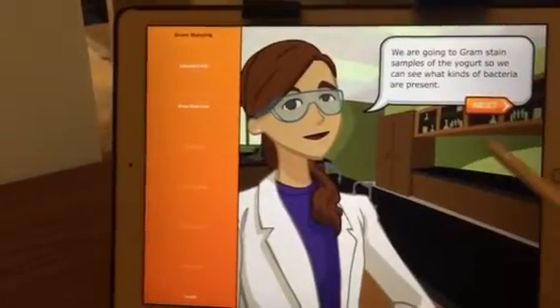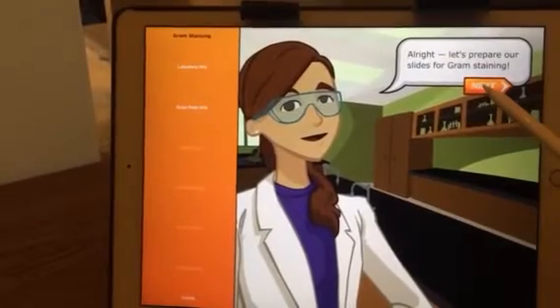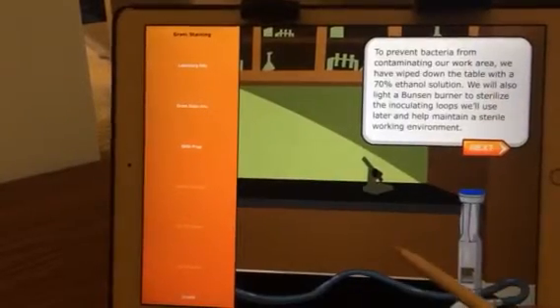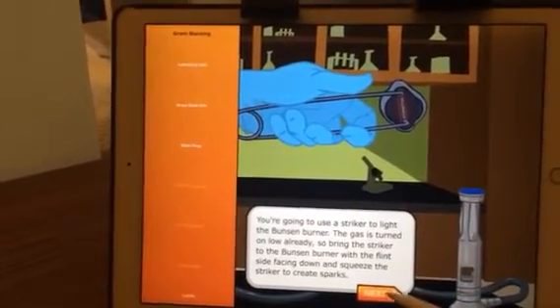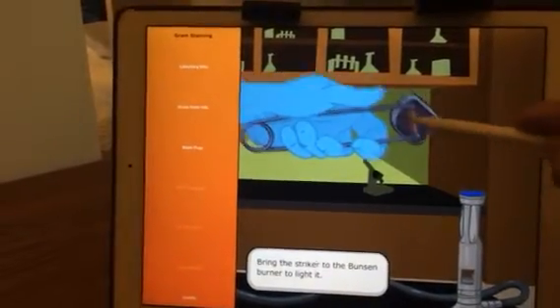We are going to gram stain samples. Alright, let's prepare our slides for gram staining. To prevent bacteria from contaminating our work, you're going to use a striker to light the Bunsen burner. Bring the striker to the burner to light it.